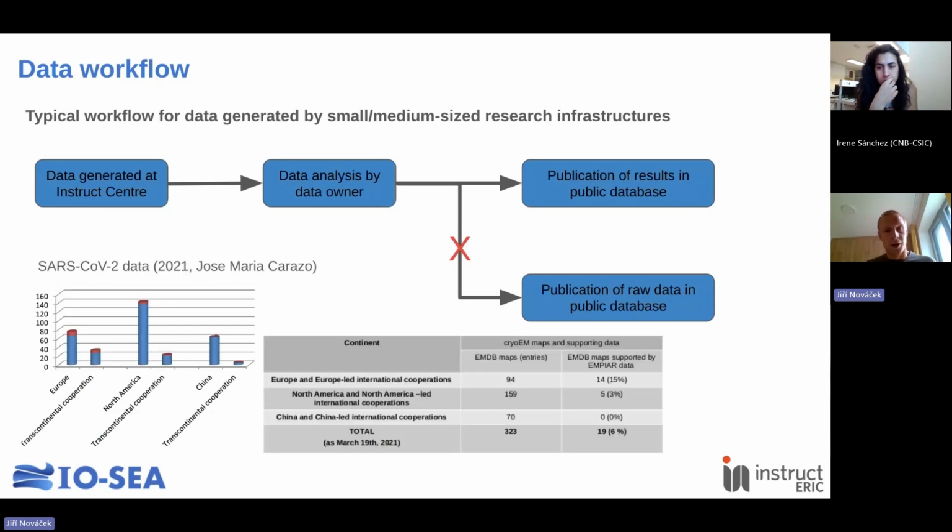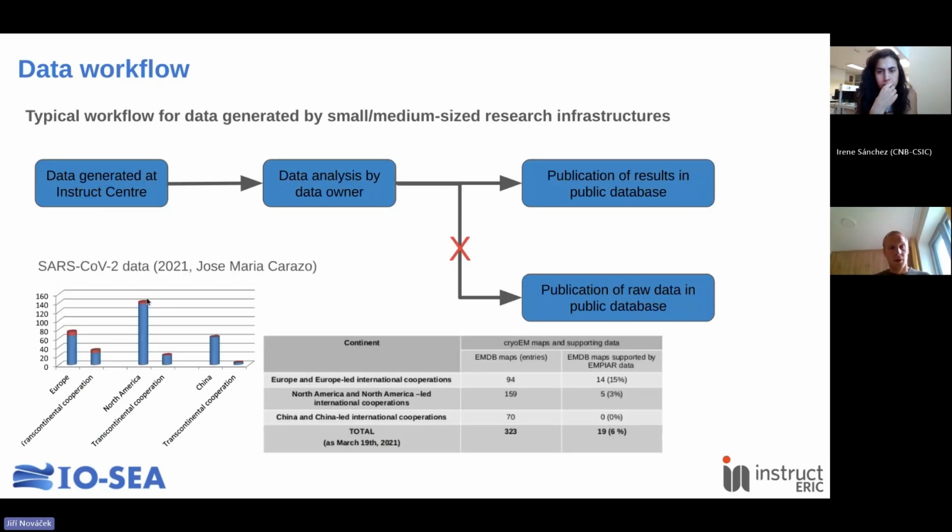Similarly, and I will now show you the data that was shown to me 3 years ago by Jose Maria Carrazo, during the SARS-CoV-2 pandemic, the EM community has produced a large number of structures, but only for very few of them the original data were published together with the structural data itself.